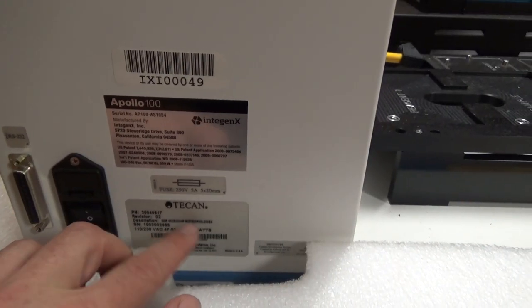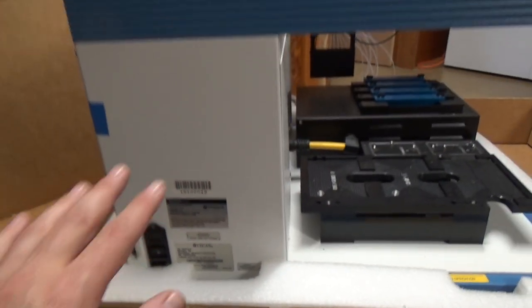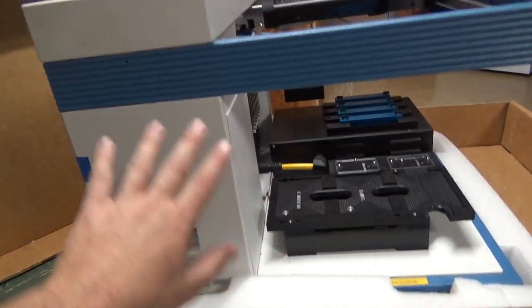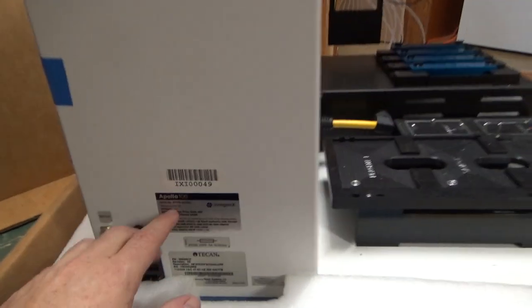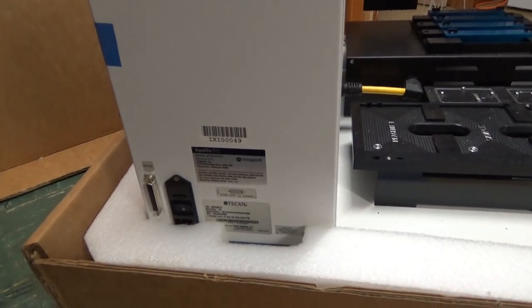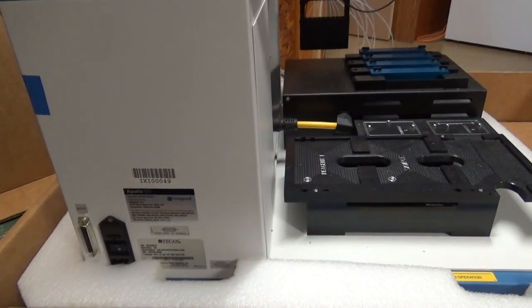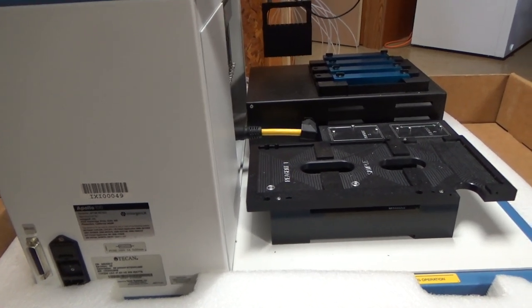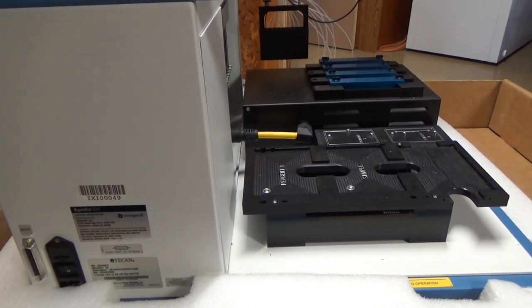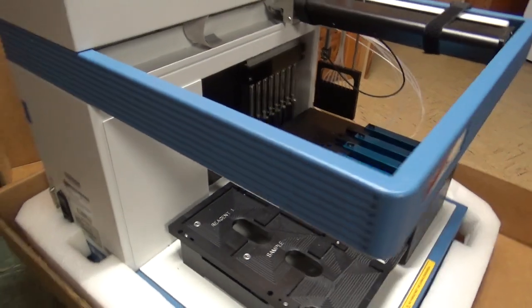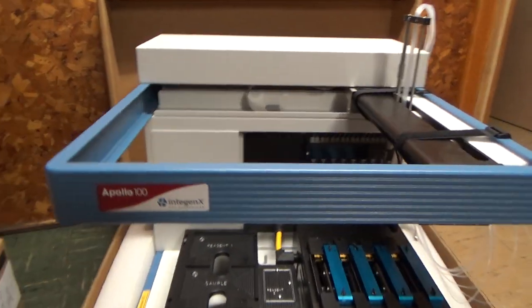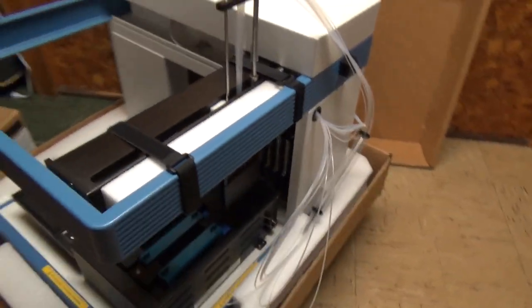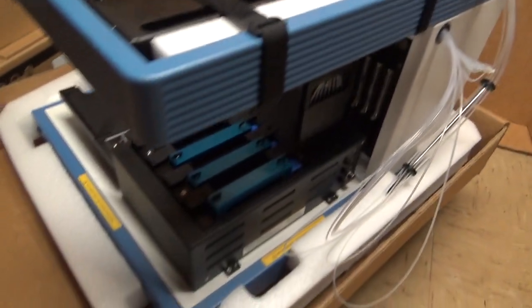Looks like TCAN makes part of this. I think from what I found, TCAN is the company that makes the frame and some of the motors and stuff. And then Intigen X makes some of the fluid handling stuff. I'm not 100% sure. There's not a lot of information on this out there. There's a couple websites on the Wayback Machine. There's a couple professional papers about using this, but there's really not much else. There's no brochures I can find. There's no pricing information for what this originally cost. I'm sure it was over $10,000 originally.